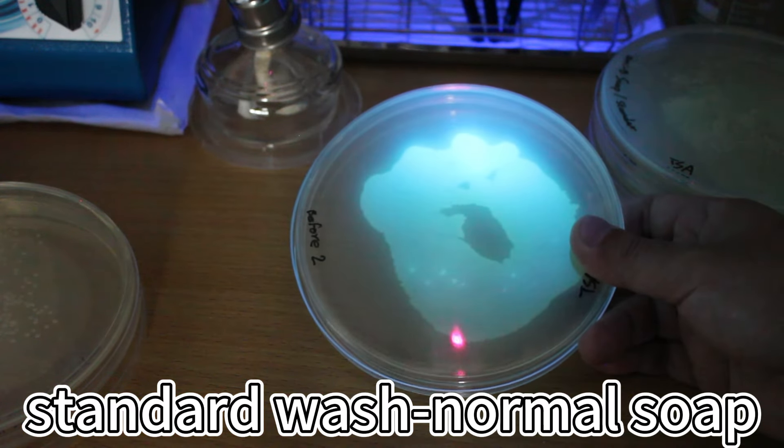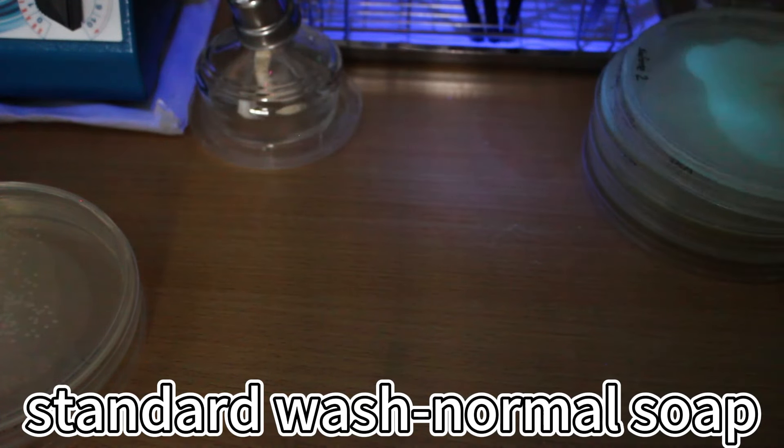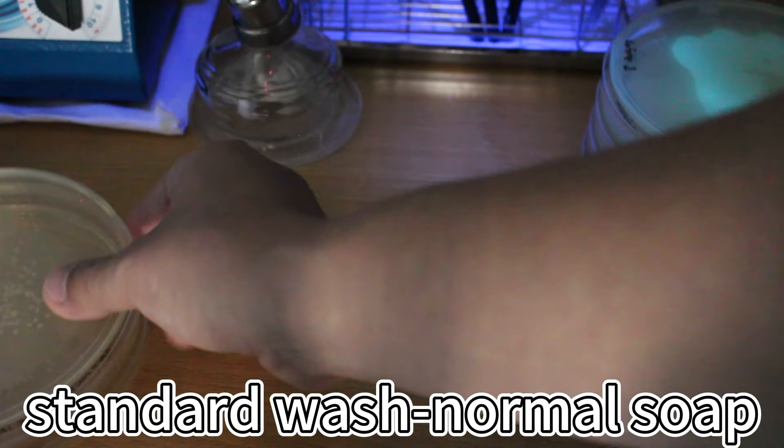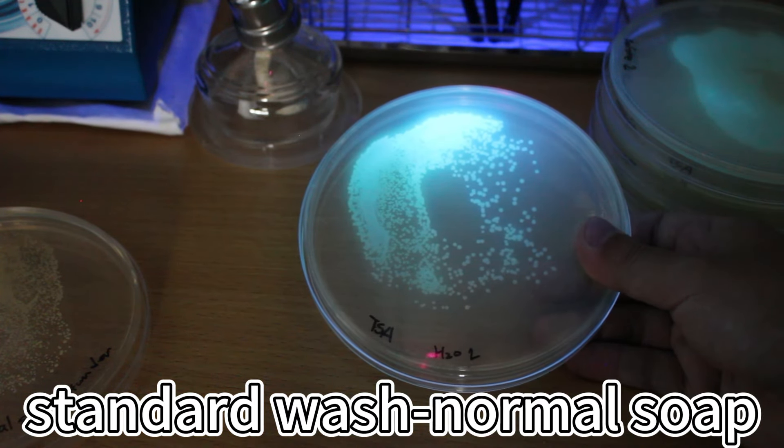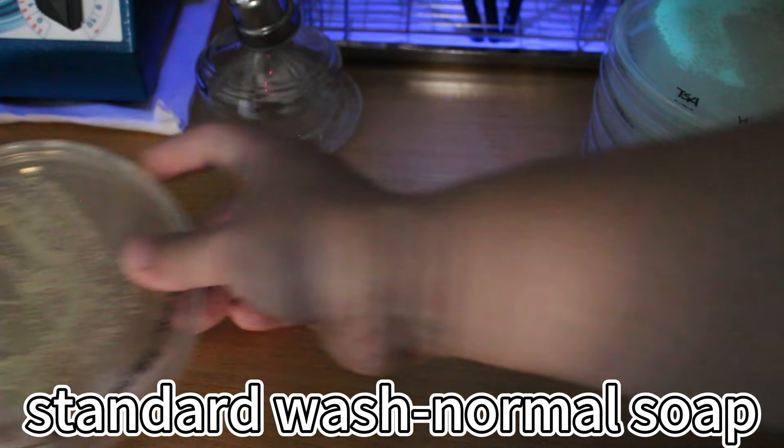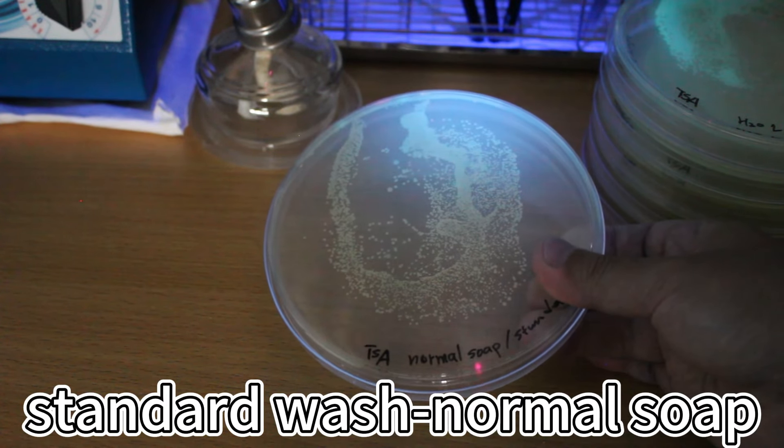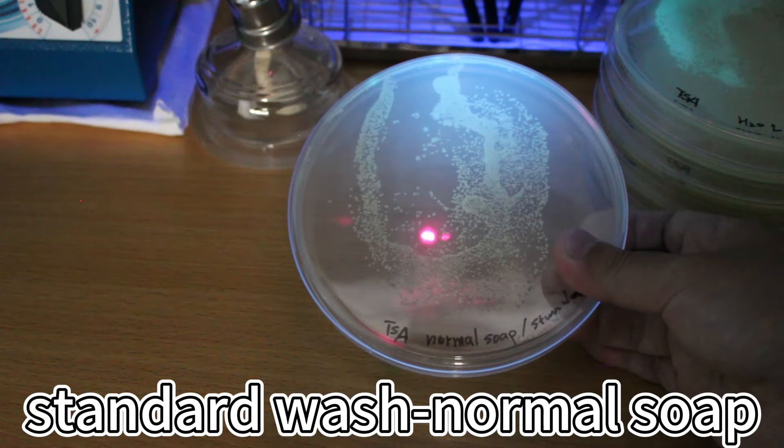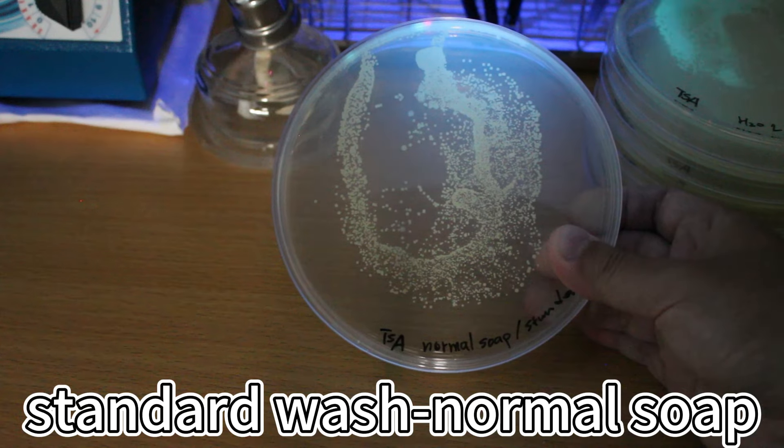And then this one is before wash. Now let's see the normal soap group. This is after water rinsing. Some of the bacteria get washed off somehow. And this is after standard wash. You can see there is only a very little glowing colony left.